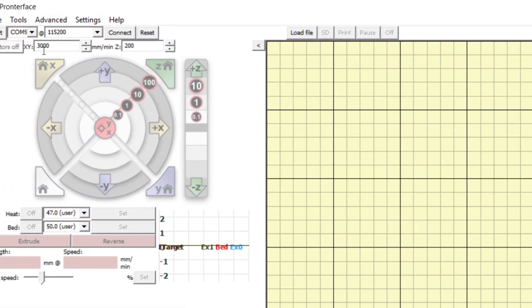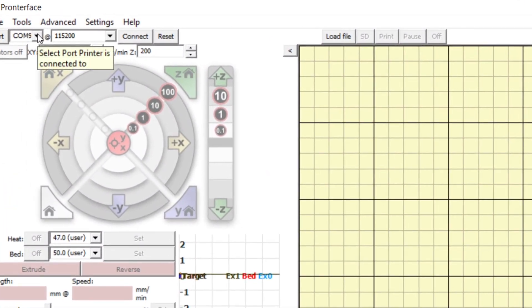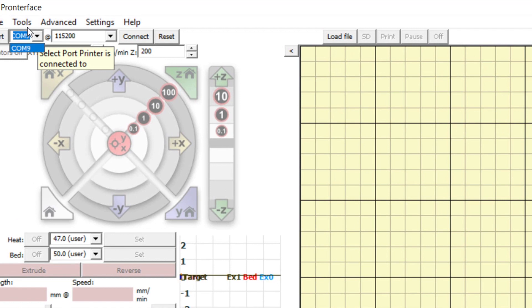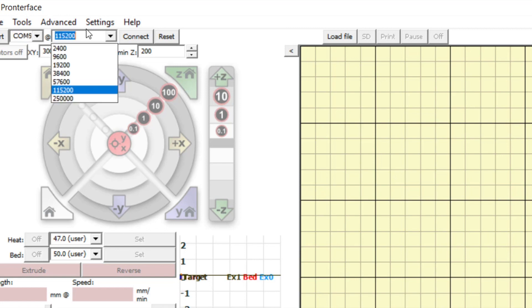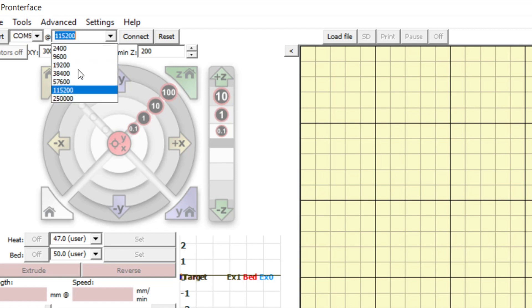First make sure that your bioprinter is connected to your computer with the USB cable. Then in the drop down menu next to port, choose the proper port, and make sure that the drop down menu next to that is set to 115200.